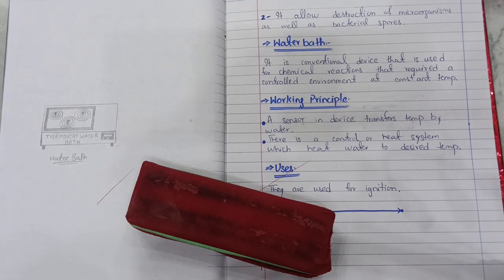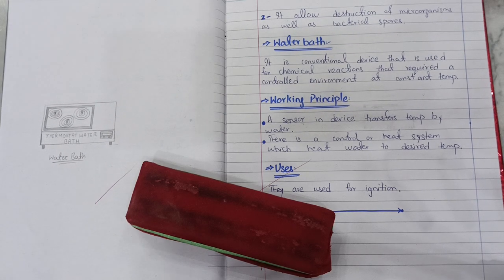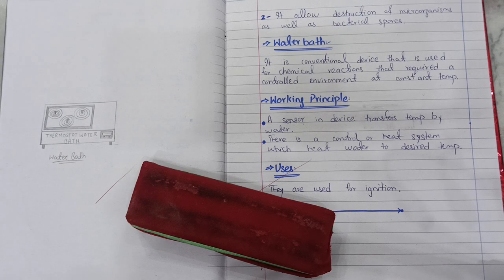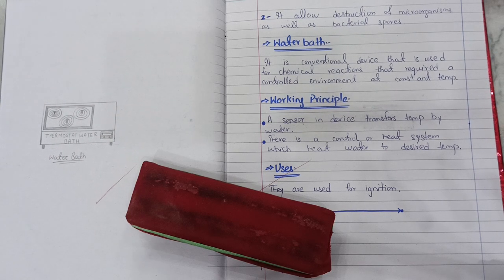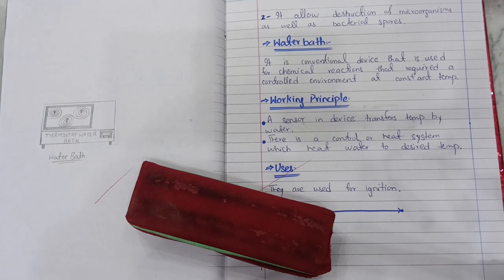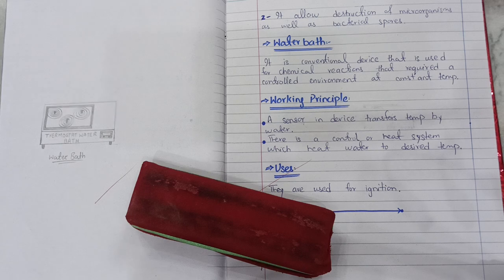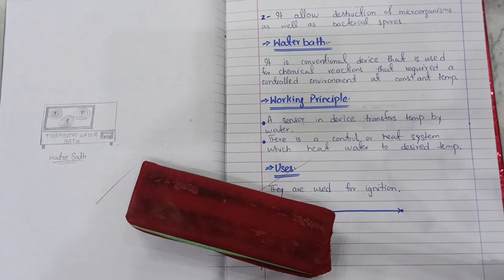यूजेस क्या है, they are used for the ignition purpose. यानी किसी चीज़ को जब जलाना होता है ना तो हम उसके लिए वाटर बाथ वगैरह को यूज़ करते हैं. हम बंसन बर्नर भी यूज़ कर सकते हैं बट कुछ ऐसे केमिकल रिएक्शन होते हैं जिनको हम डायरेक्टली बंसन बर्नर पे नहीं रख सकते. और दूसरा बंसन बर्नर पे इसलिए भी नहीं रख सकते क्योंकि बंसन बर्नर एक कांस्टेंट टेम्परेचर अनफॉर्चुनेटली प्रोवाइड नहीं कर सकता है. सो अगर आपकी कंडीशन है उस केमिकल रिएक्शन के लिए कि आपने कांस्टेंट टेम्परेचर प्रोवाइड करना है देन आप वाटर बाथ को यूज़ कर सकते हैं.